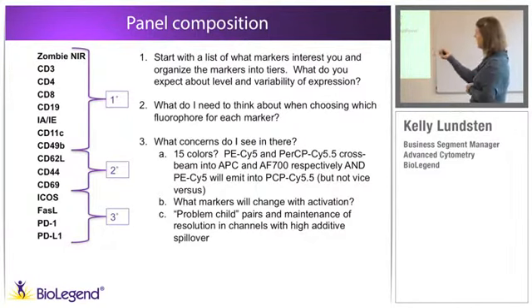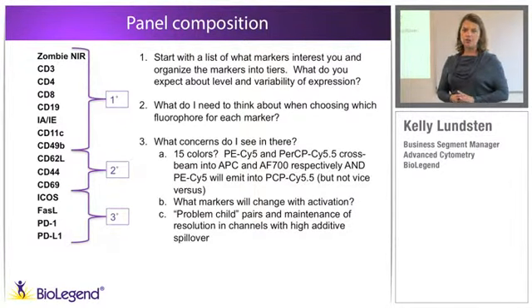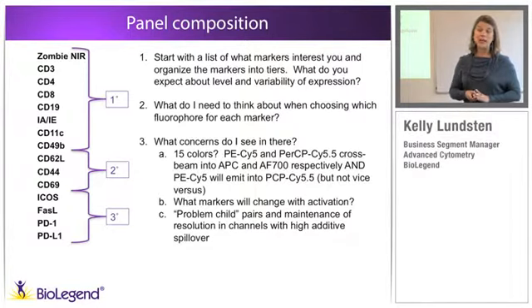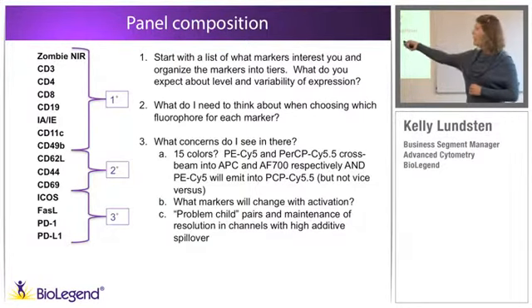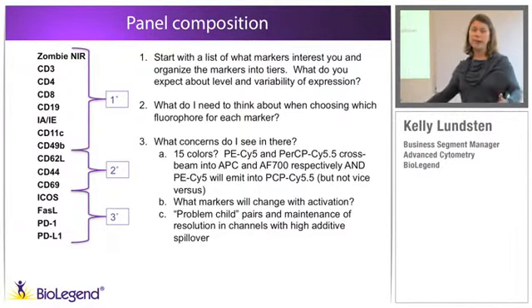So the other thing I need to look at, I have lots of these markers that really are not going to change tremendously with activation. Again, they're discretely resolved. But I'm going to have a few of them that will change tremendously with activation. They'll go from being entirely negative to potentially being off scale. And that's going to make a really big difference for what this range of secondary molecules are conjugated to, and then how much background those fluorophores are populating.